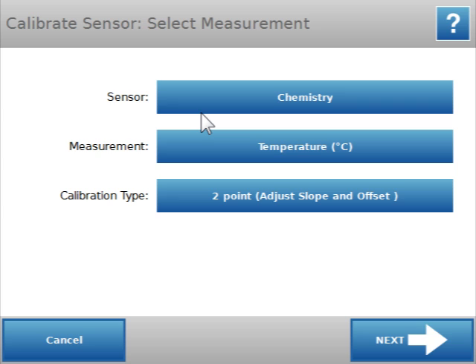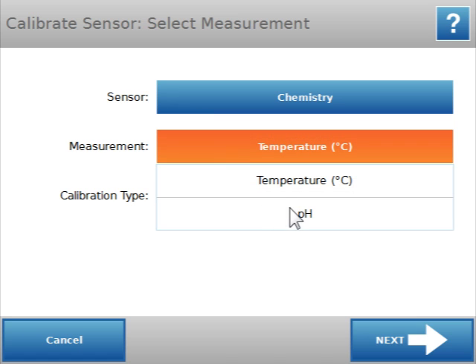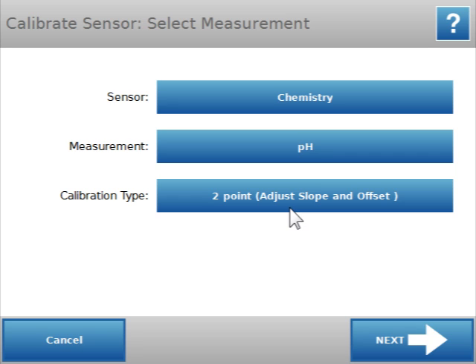You'll see it shows that I have the chemistry sensor connected. The measurement that comes up by default is temperature, but we want pH. So I'm going to touch on that to select pH. You'll see it's already set up for a two-point calibration, which is what we want to use with the pH sensor. I'll say next.